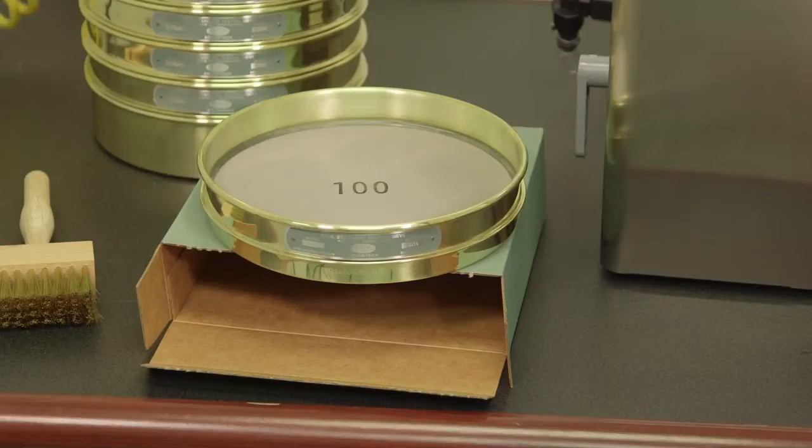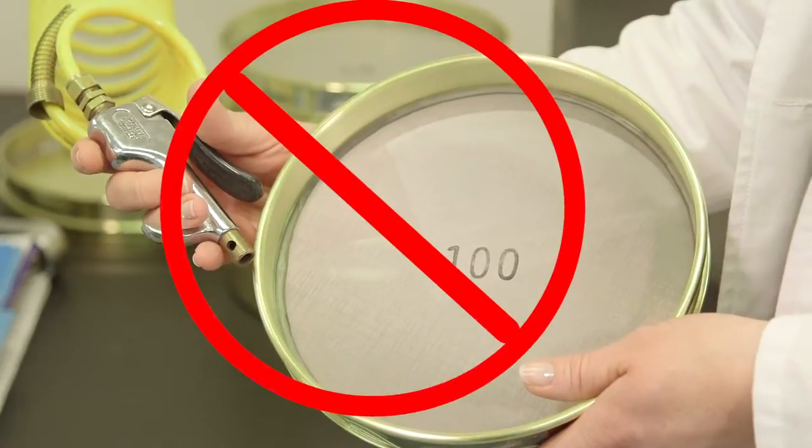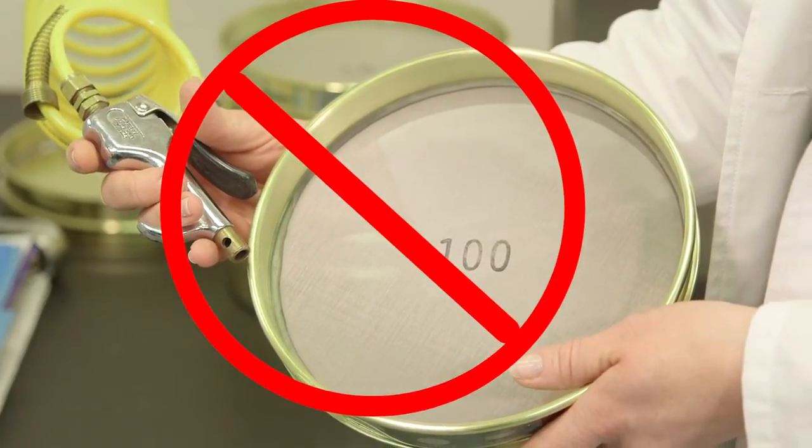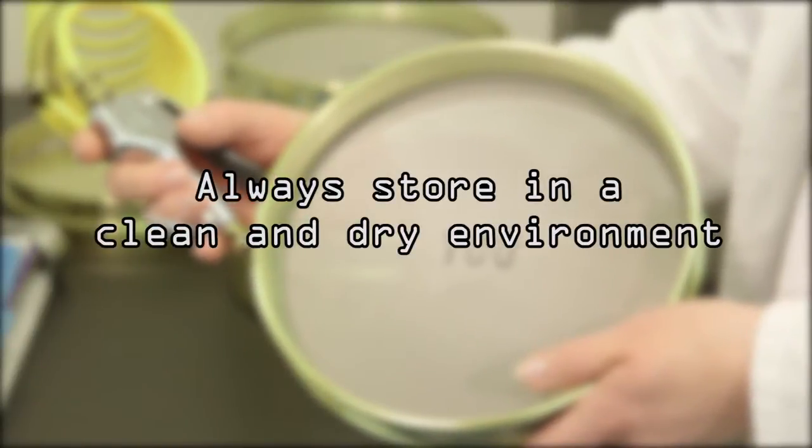Be aware that exposure to temperatures above 261 degrees Fahrenheit may cause the wire cloth to distort and loosen, as the solder will begin to soften at this point. Do not use forced air on number 100 or finer wire cloth, as screen damage may result. Always store your test sieves in a clean, dry environment.